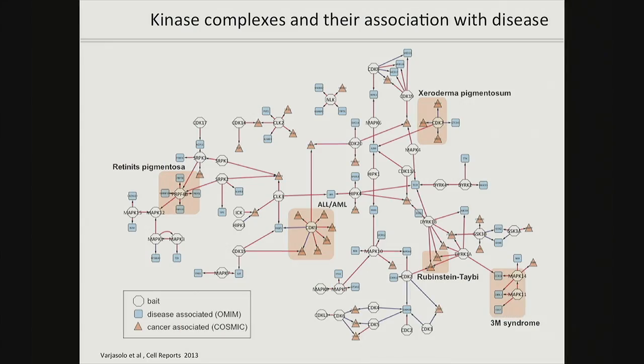So let's first describe what the graph shows. The graph always shows a protein kinase, these octagons. We show other proteins which have either triangular or rectangular shape, and then we see a number of edges. Edges mean that the proteins physically interact with each other, at least what we conclude from this data.